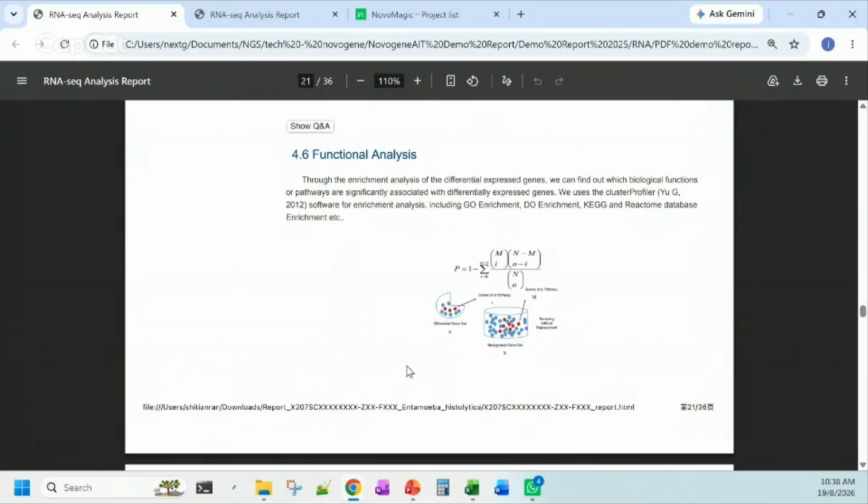After we have identified the genes that are differentially expressed, next we want to identify what functions are involved, whether these genes are affecting certain functions or certain pathways affected by the sample conditions. The normal method to do this analysis is the enrichment test, or enrichment analysis. This checks how many genes are involved in certain functions, out of the total differentially expressed genes obtained.